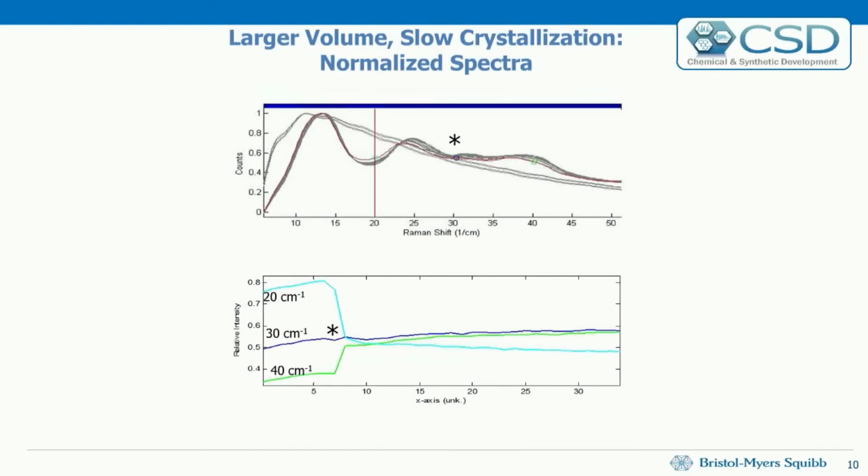In the next slide here, and this is just a nice quick example, hopefully it helps clarify. You can see this long amorphous boson peak, fairly undefined, as you're approaching zero, or the laser line. In this particular case, I cleaned this up because we were following these changes occurring with one of our compounds. If you were to monitor, let's say, at 30 reciprocal centimeters, I'm not going to see a difference, and that's what's shown below.